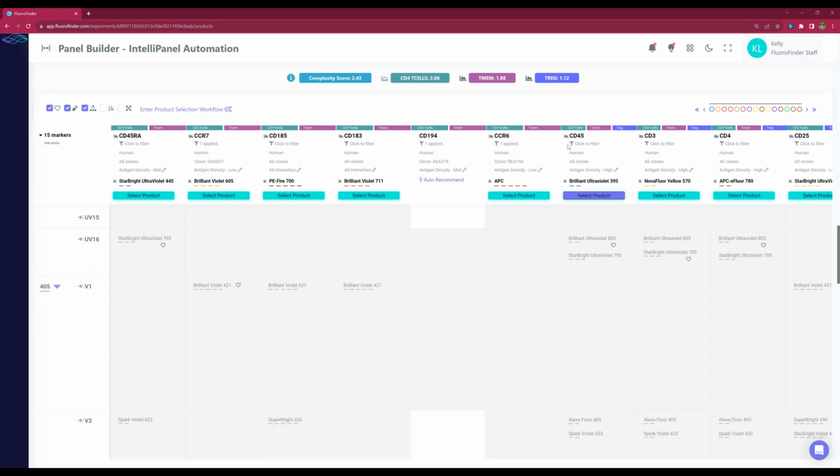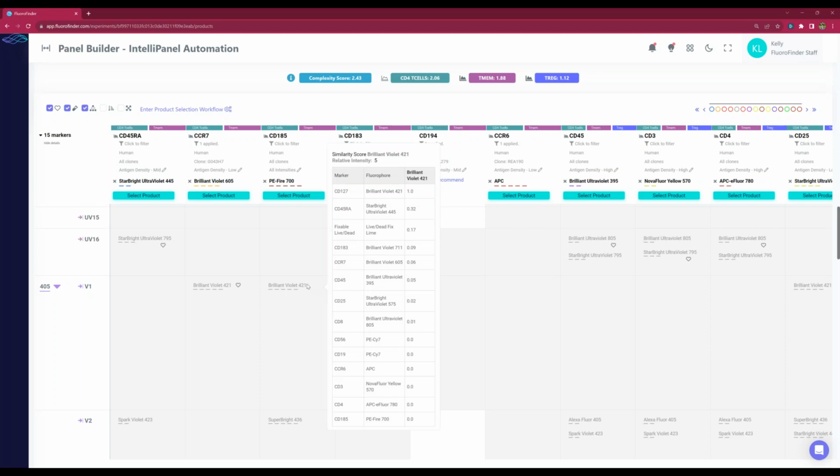See, so this kind of makes me giggle because I always put CD45 on BUV 395, and what it's doing is actually learning from others. So if you really wanted to screw with the IntelliPanel, you would feed it a lot of gibberish. Instead, it's being fed by people like me and my cohort who are all relatively well-versed in flow, and the kind of choices that we're making are teaching the algorithm in order to make good decisions for you. I wouldn't exactly call it artificial intelligence because it's really only regurgitating the choices that we've made, and it will do that over time when it becomes amassed.